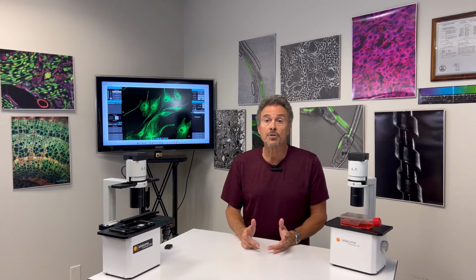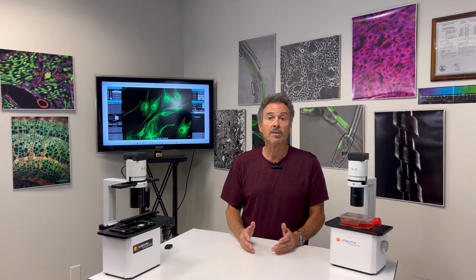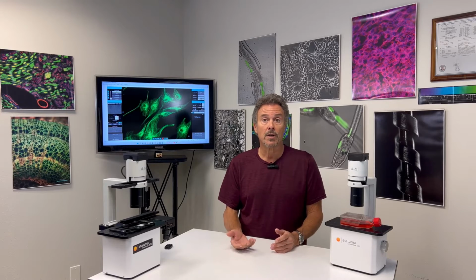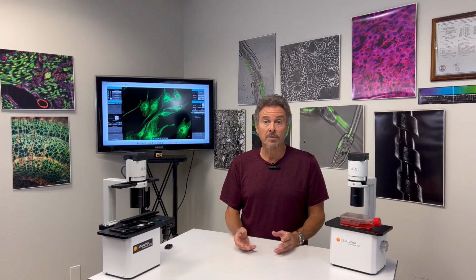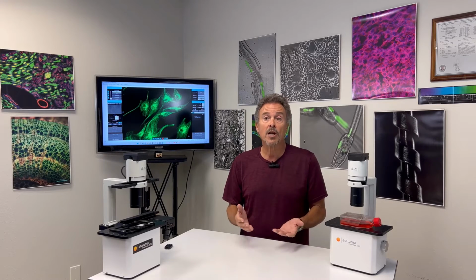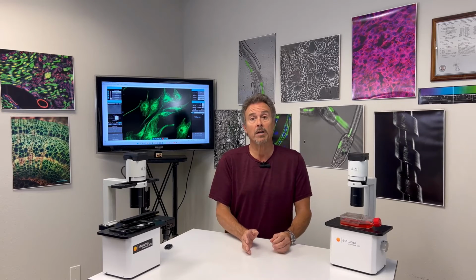The ultimate resolution of wide-field microscopy is the diffraction limit. This is based on the wavelength of light used to produce the image. The diffraction limit is approximated as the wavelength divided by 2. So for a typical green wavelength of 500 nanometers, which is the center of our visible spectrum, the diffraction limit is approximately 250 nanometers, or a quarter of a micron.